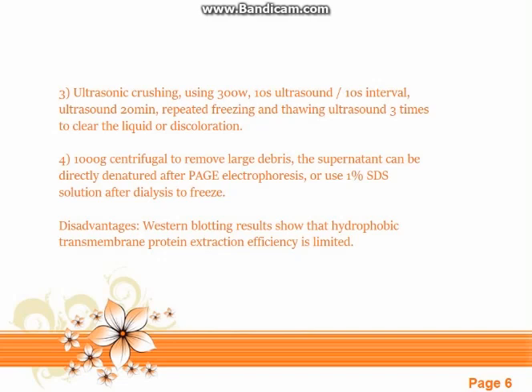Disadvantages. Western blotting results show that hydrophobic transmembrane protein extraction efficiency is limited.